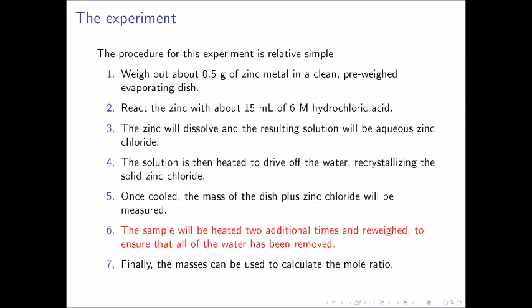At this point, we cannot be sure that we have driven all of the water out of the crystal. So we will heat the sample 2 additional times and reweigh after they have cooled in order to ensure that the mass is stabilizing.